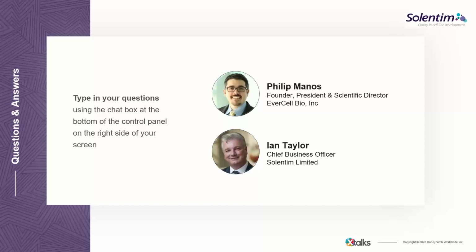Interesting. Another question, and this one is for Phil: is the VIPS system compatible with enrichment strategies like FACS? Great question. Yes, we certainly feel like it is. Our model, generally speaking, is the less manipulation the better, but in situations for FACS or enrichment, you can perform a MACS or a FACS prior to loading those cells into the VIPS. We very much see it as complementary, and the VIPS still adds that clonality factor and the confidence in the cell that you're selecting.